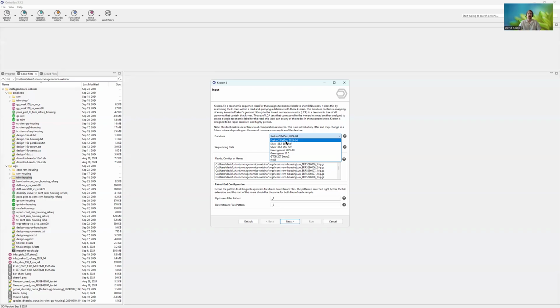It's very big and contains the whole genomes. Then we have some 16S databases here: Silva, Green Genes, Green Genes 2, GTDB, and also something here called WOL2. You will not see that if you open up OmicsBox. I will explain to you in a second why.